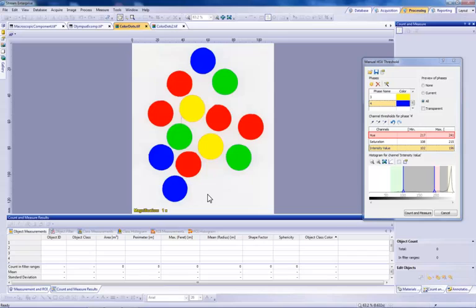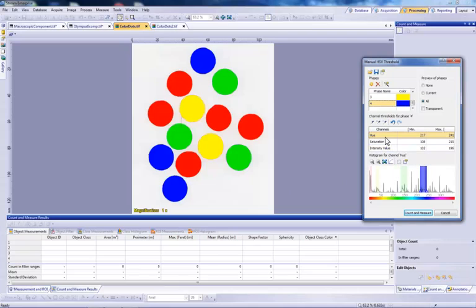ranges defined. If we select Hue from the channels, we can then see the individual color range selections in the histogram below. If we were not to use the dropper tools, we would have had to manually select each phase of hue and define the individual intensity and saturation values, which is quite time-consuming.